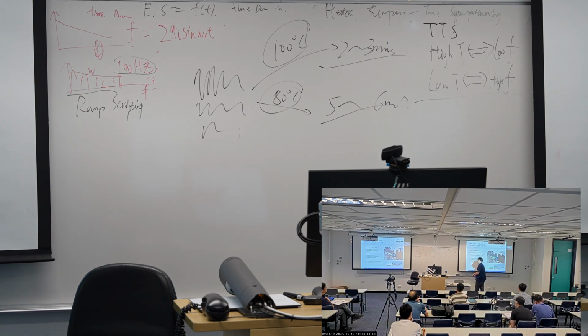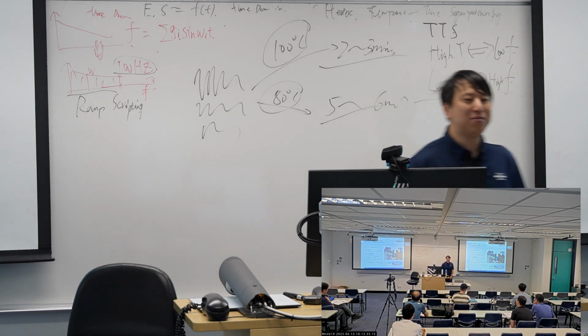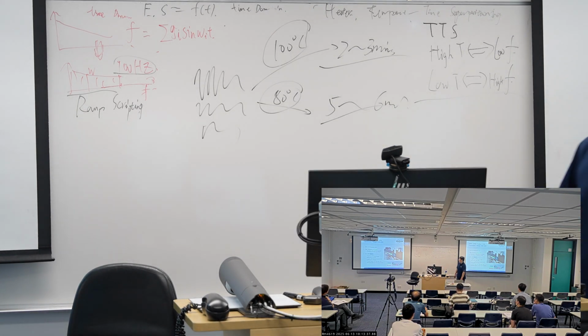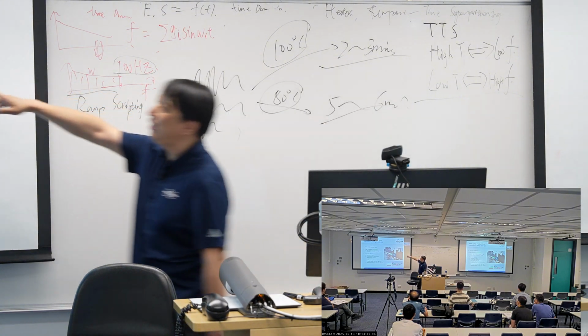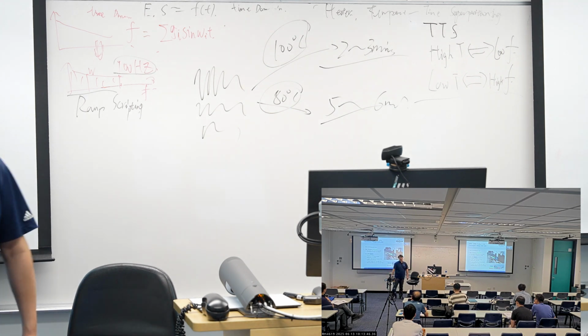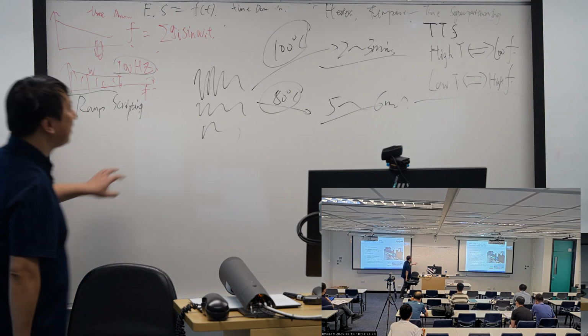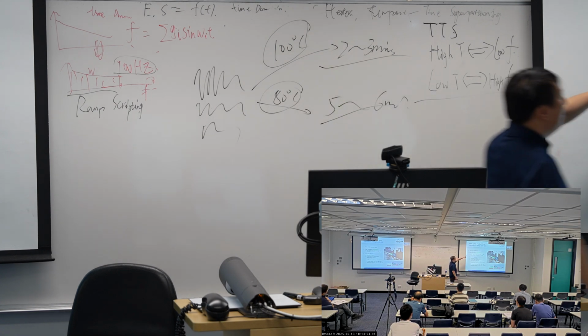But nowadays, for scientists, you can do anything you want. You can study the tires' property on Mars. So Bruker introduced the 20 kilohertz, some due to the financial reasons to make it different, and some maybe because the scientists want to do something differently. So we have the 20 kilohertz.